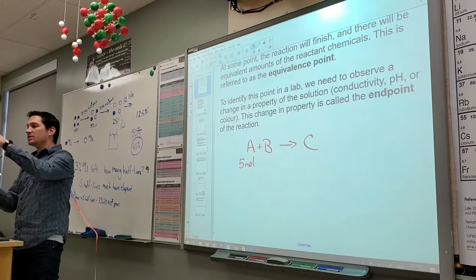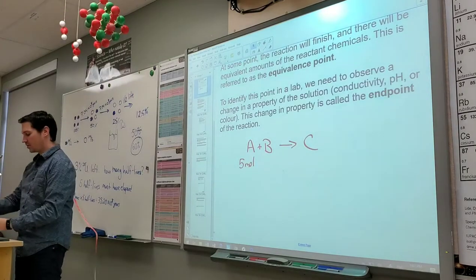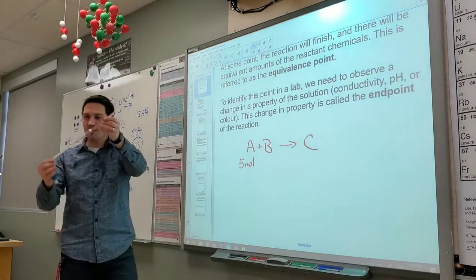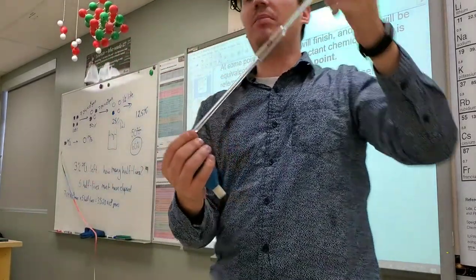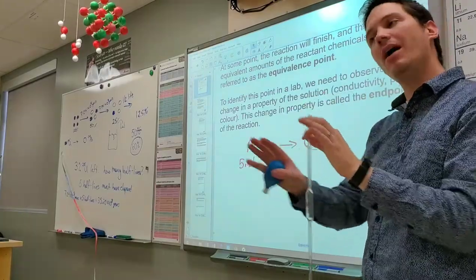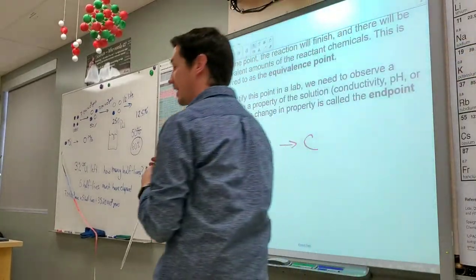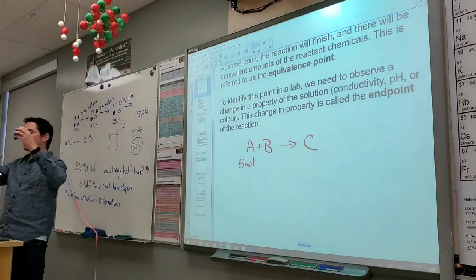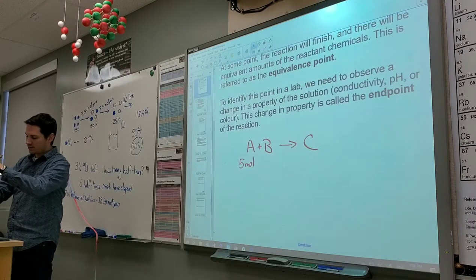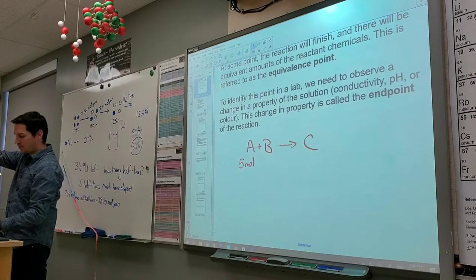Okay, so in here, I've got an acid. And in here, I've got a base. If I take a very precise volume of my base, do you remember what this is called? This is a pipette. What is the purpose of a pipette? Yeah, to get a very precise volume, maybe not exact. It's not exactly 10 milliliters, but it's about as precise as we could possibly get it. I'm going to take my pipette and pull up 10 milliliters of my sample, the same way I normally would any other day. Boom, 10 milliliters, awesome.